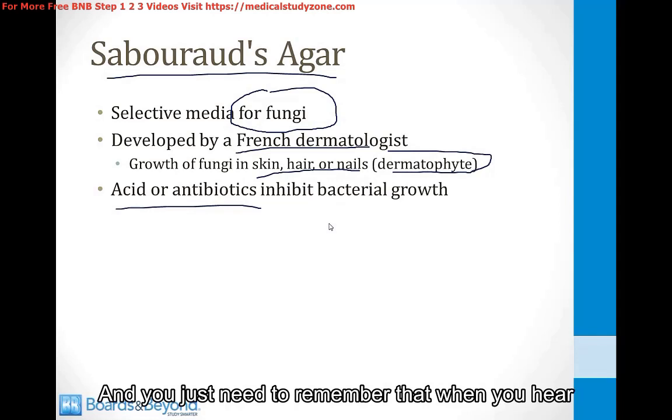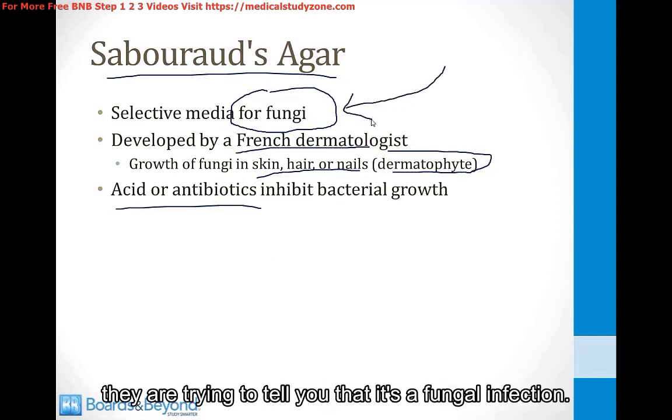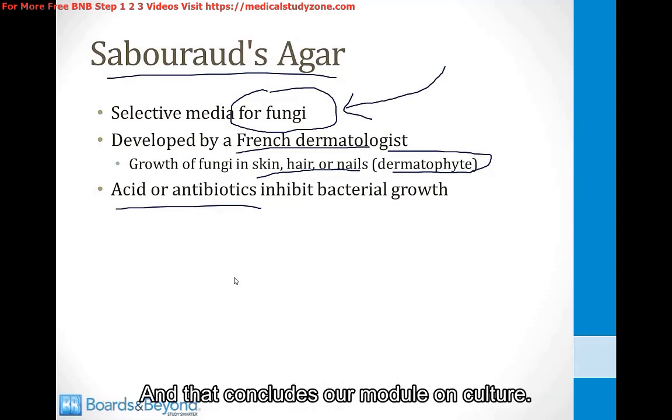And you just need to remember that when you hear about something growing on Sabouraud agar, they are trying to tell you that it's a fungal infection. And that concludes our module on culture.